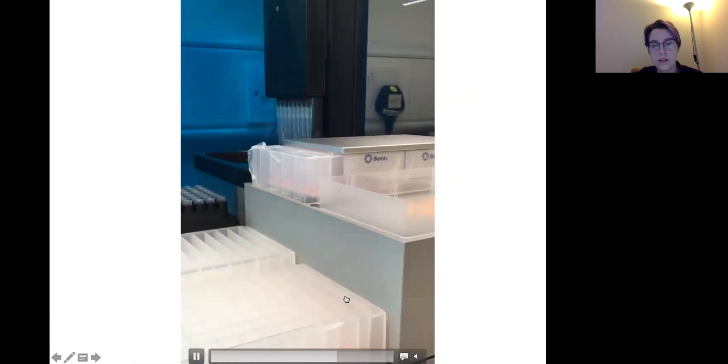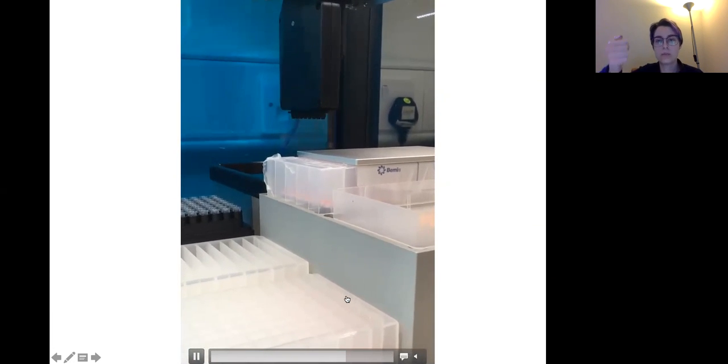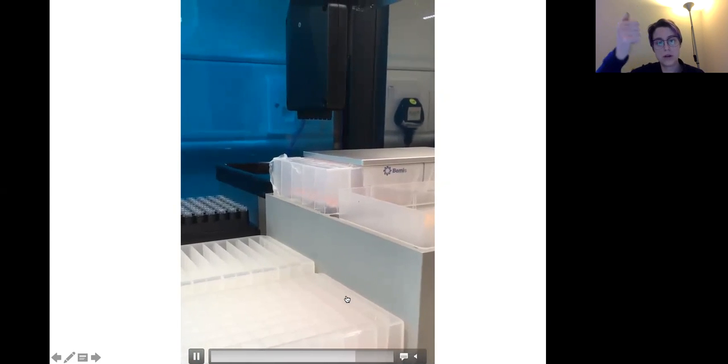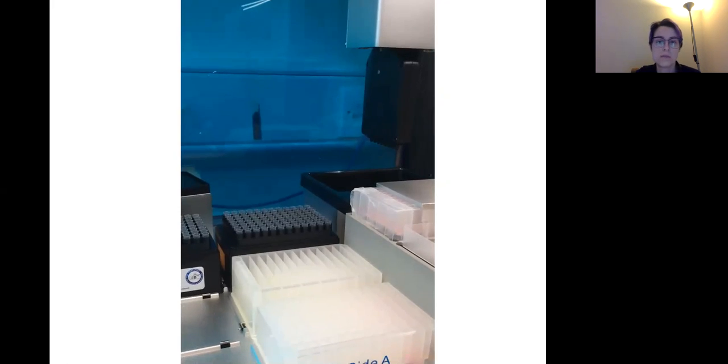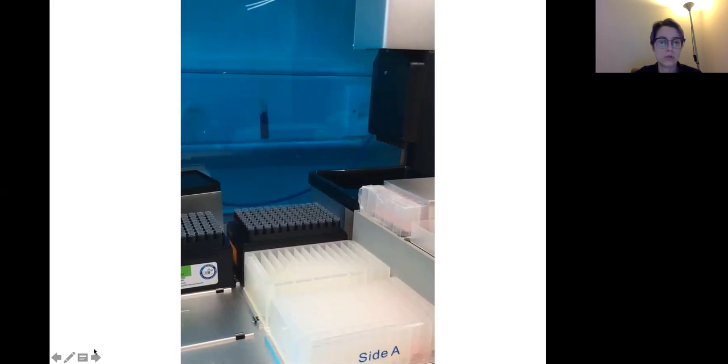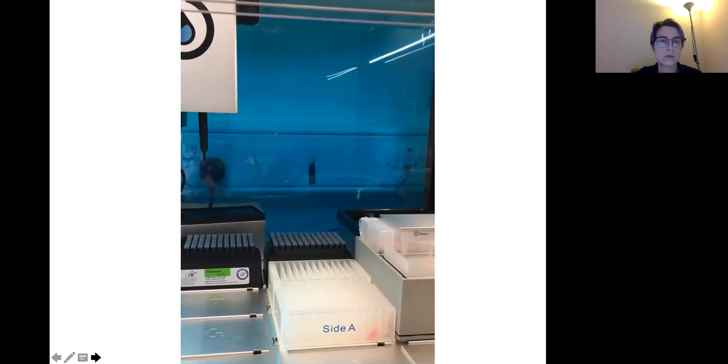And so in this case, it's mixing. So it goes up and down as you would pipette into the well, then you can ask the robot to do it instead. It's quite useful, and this is the alternative of, for example, a vortex that we don't have in the robot.